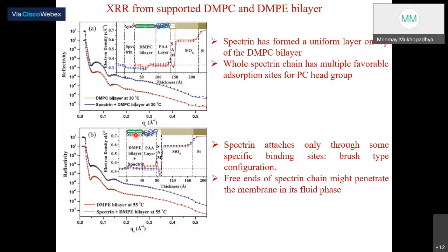When you have a PE packed region, the cytoskeleton breaks, and because of that breaking, molecules from outside can come in, or molecules from inside can go out. This way, cell transportation can be modeled or talked about from this kind of measurement.